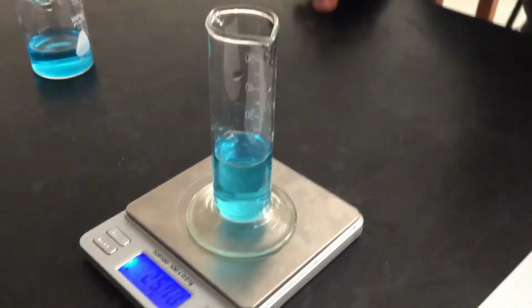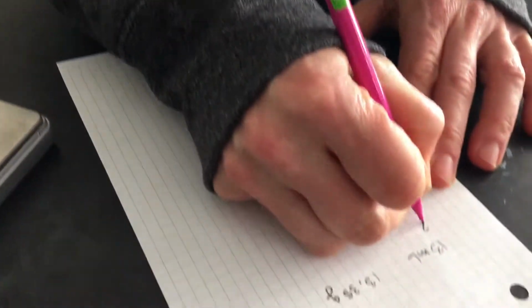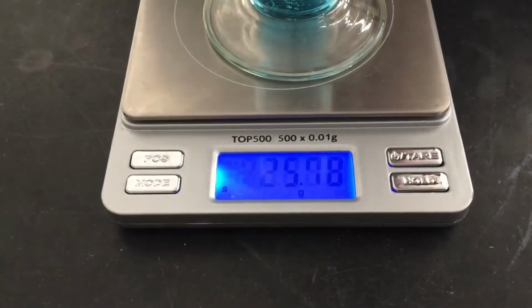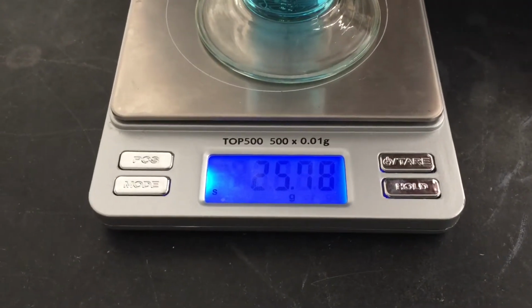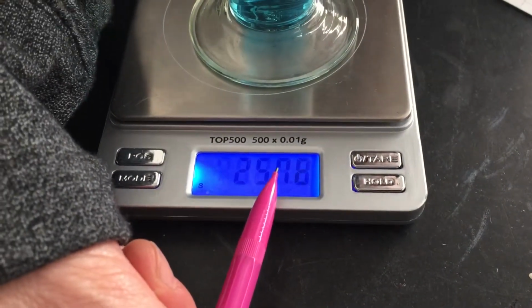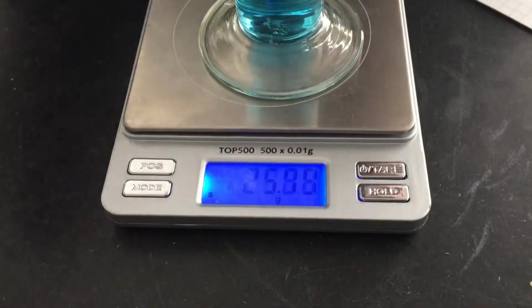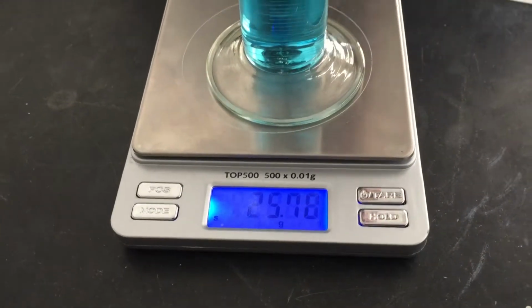So my next measurement looks like 23 milliliters with a mass of, I'm reading it upside down, but I think that's right, 25.78 grams. It just changed. We're going to be rounding to the nearest decimal point, it doesn't really matter. So 25.8 grams, essentially, once you round it off.